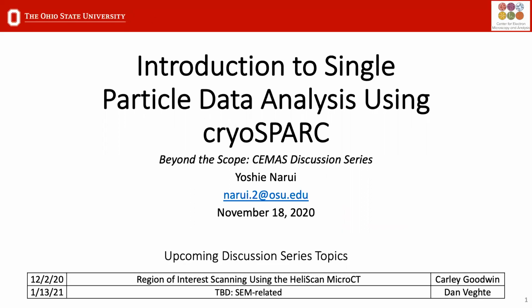But what CTF estimation is actually doing is taking your image and then calculating a function that will match your CTF. I'm not going to show you the equation, but if you have questions about that, we can cover it at the end. Okay, so what else do we need to know?